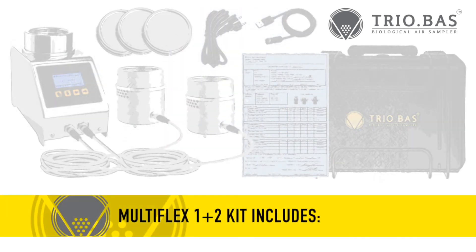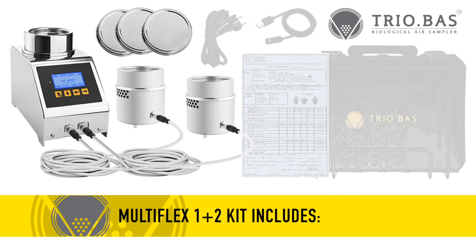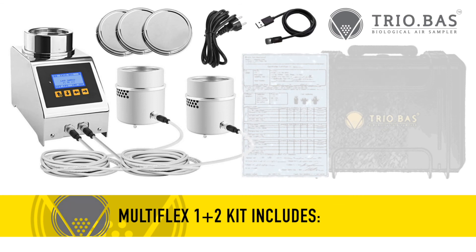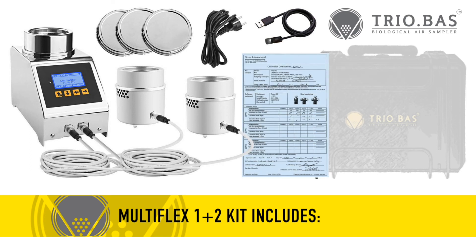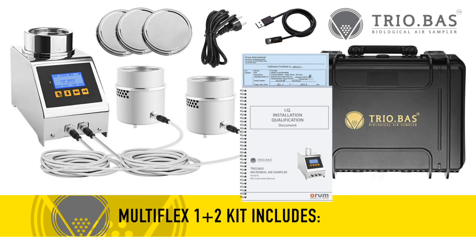The Multiflex 1 Plus 2 kit includes the instrument, two aspirating chamber satellites with two 5-meter-long attachment cables, three stainless steel aspirating head covers, one instrument charging cable, one cable for optional sampling data transfer, the manufacturer's calibration certificate, IQ-OQ-PQ documents, and a carrying case.